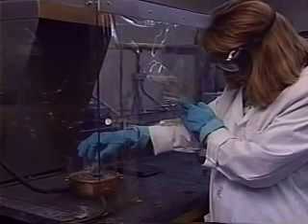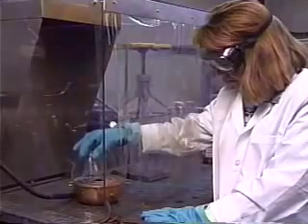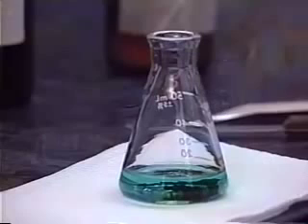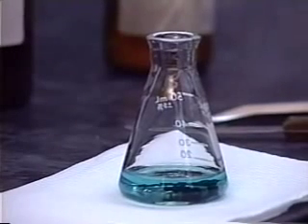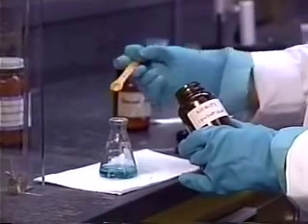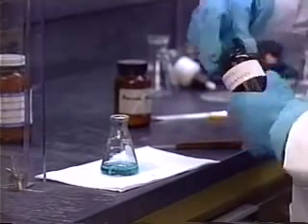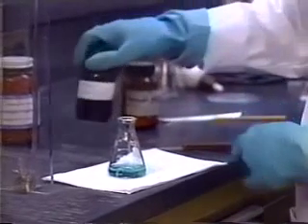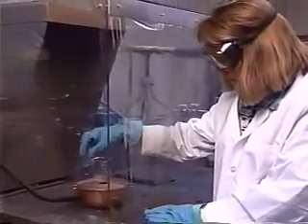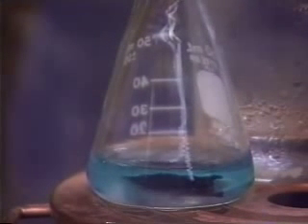Hold the flask against a white sheet of paper or a paper towel and see if the color has disappeared. If it has not, continue heating and swirling for several minutes. If it is still colored, add another small portion of norite and continue heating. If you notice any white crystals of cholesterol at any time during this process, add a milliliter more solvent.